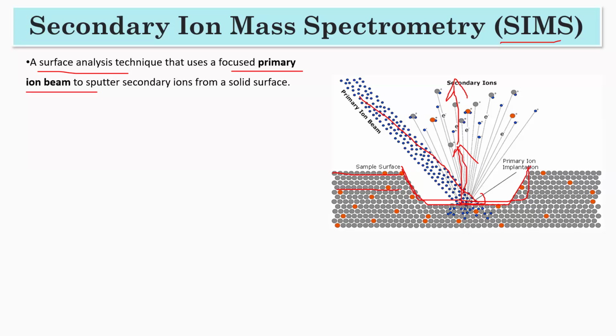So you can use this, if you can combine this with mass spectrometry, you can know what kind of organic molecule is present, right? Sometimes, suppose you make thin films of some materials, then it's difficult to study them, right? Because we may have very little sample, so we cannot do NMR, maybe.